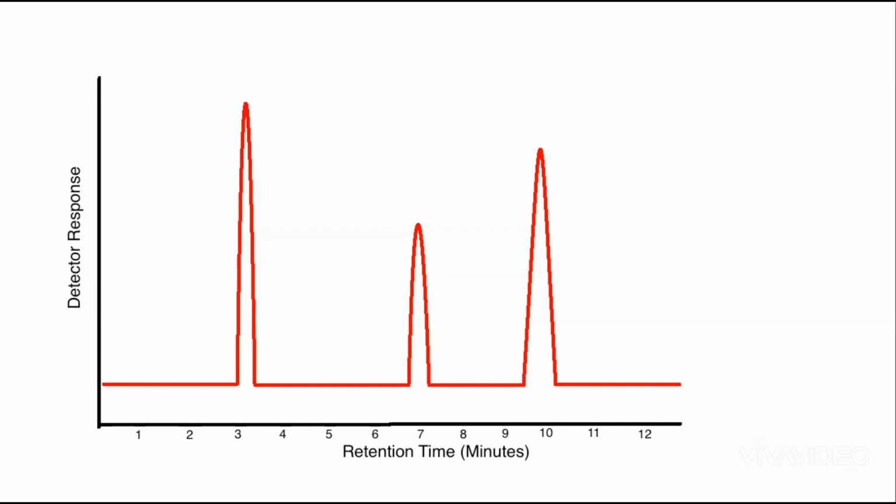And in today's lecture, I want to tackle the subject of how to analyze GC printouts, or gas chromatograph printouts. So in general chemistry and organic chemistry, it is a very common laboratory experiment to involve gas chromatographs in some way, where you either form a product, do a distillation, or just try to separate liquids, and then you analyze the results by using GC. Many students get confused as to how to interpret these graphs and how to work with them. So that's what we really want to take a look at here today.